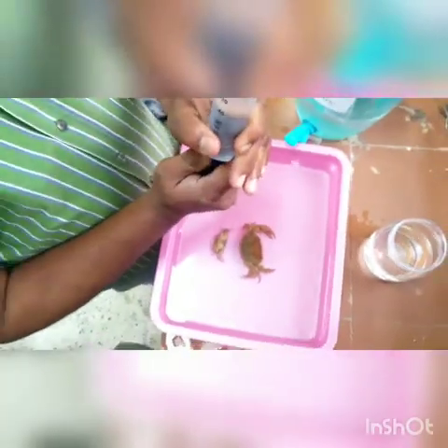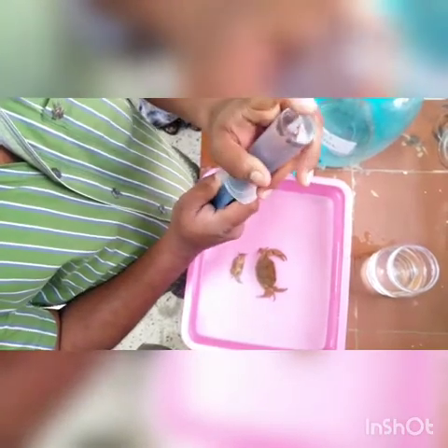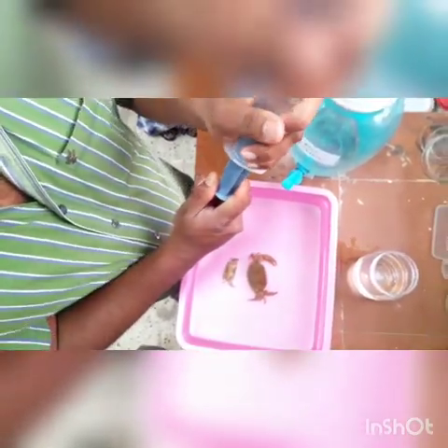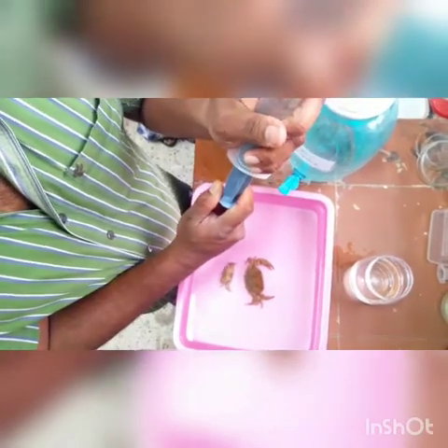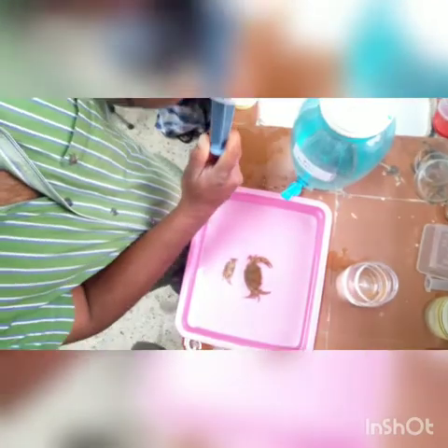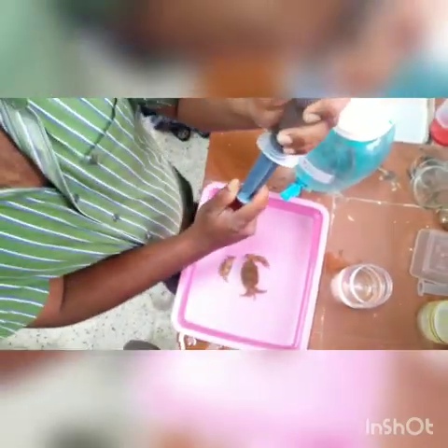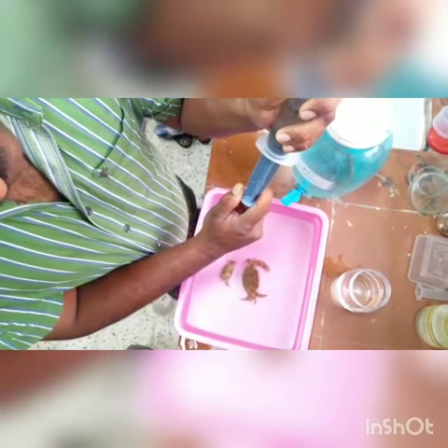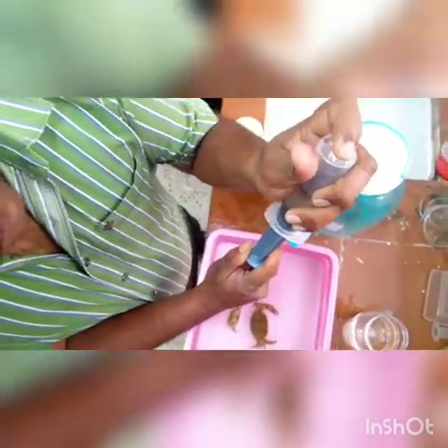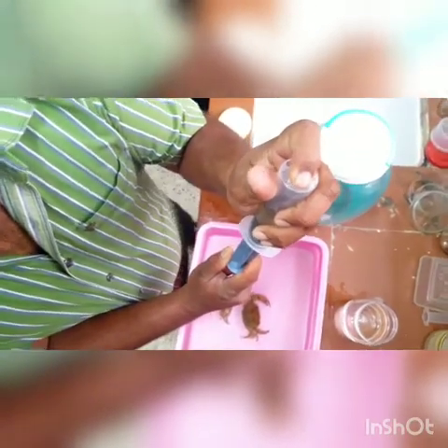Now you can see it is still floating. Then hold the tip of the nozzle here tightly, and pull back the plunger carefully, like this. All air will be removed from inside its body, then the preservative will enter.